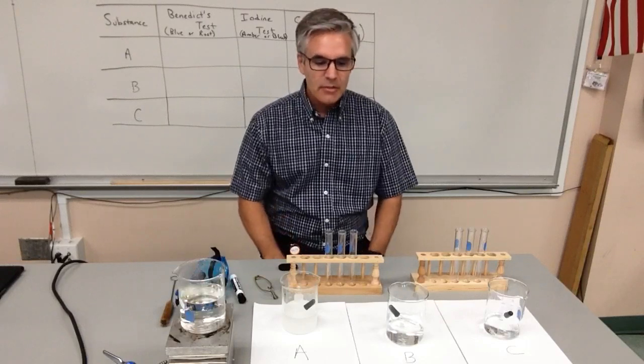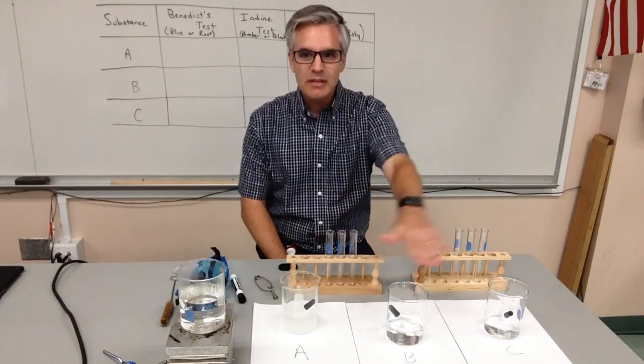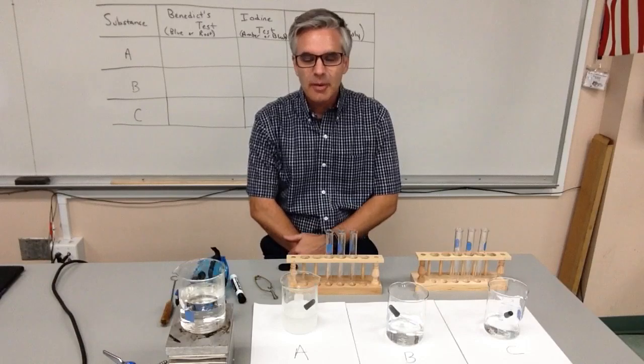Our purpose of this lab is we are here to identify what these three unknown substances are. So we have substance A, B, C, and we're trying to figure out what they are in terms of a monosaccharide, a disaccharide, or a polysaccharide.